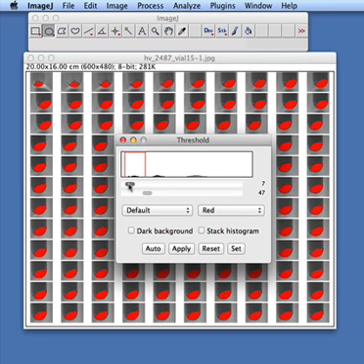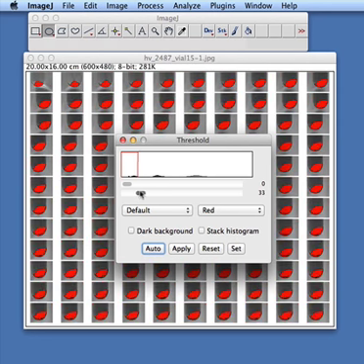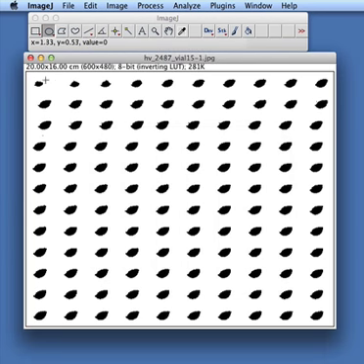I'm looking to try and have a nice solid red block without any holes in it. And that's the original coal particle and its transformations over time, and I'm going to go ahead and apply that. I hit the wrong button, so let me go back again. Somewhere around 47, and I'm going to apply, and now I have an image in which I've got a particle sequence, and I can see how it's expanding with time.